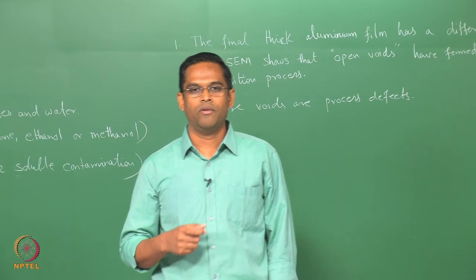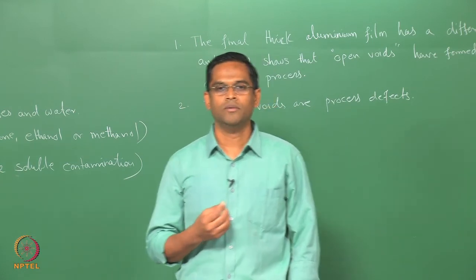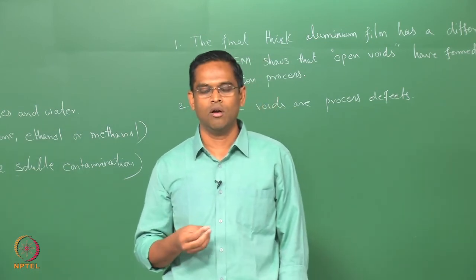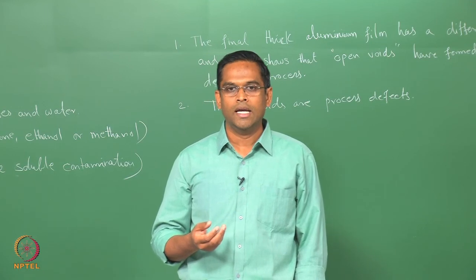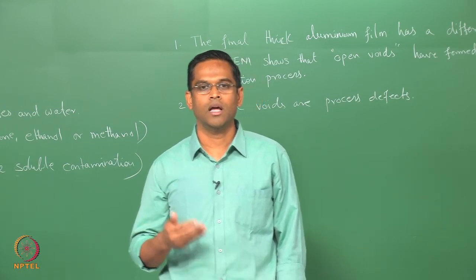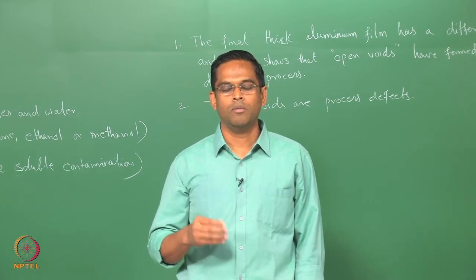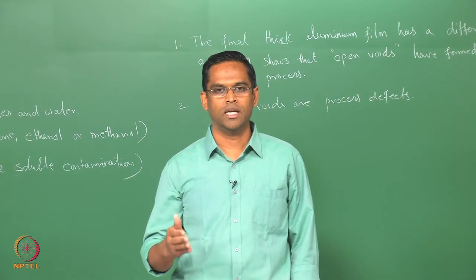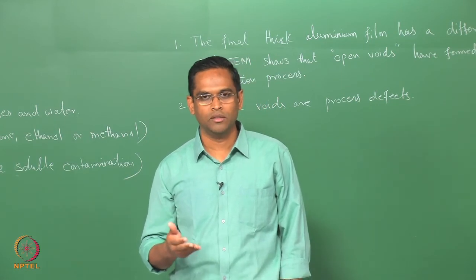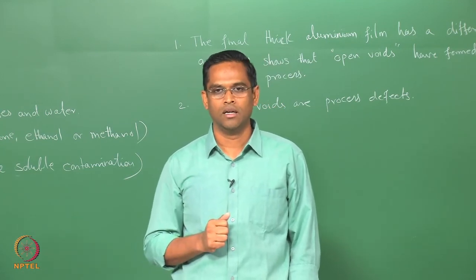And if you want to find out traces of elements, or elements which are present in very small quantities, you need to adopt another technique called WDS, or you have to go to special techniques like TEM with an attachment for electron energy loss spectroscopy and so on. So, probably those spectroscopy techniques I will discuss in another separate course, which I am right now preparing. Then if you follow that, you can get to know how to handle those cases.